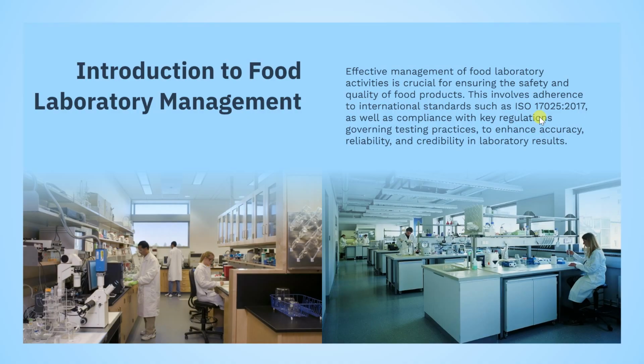Okay, from the left side in this picture, you see people in food laboratories. You see a microscope connected to a computer, someone taking measurements, someone writing, and another one doing measurements. You see the laboratory is well designed.